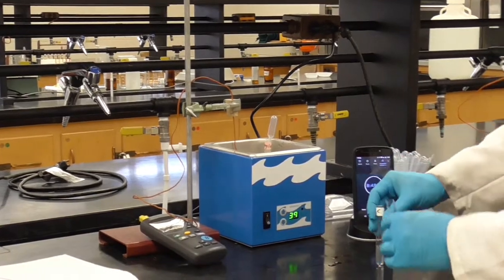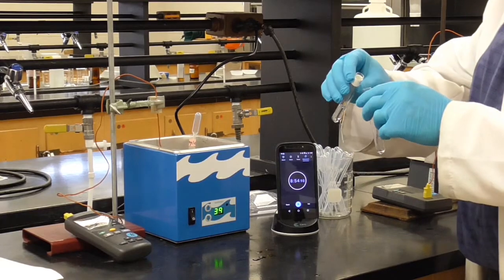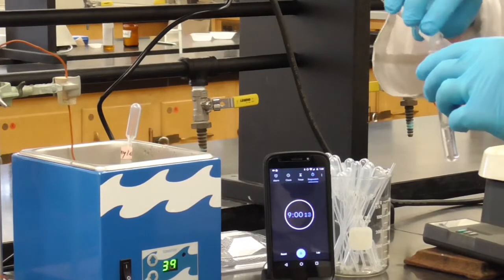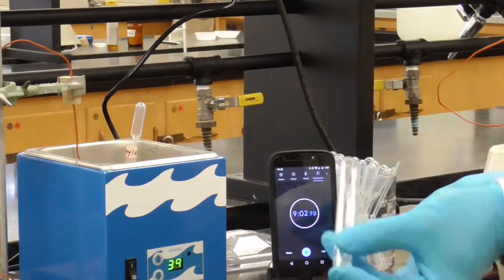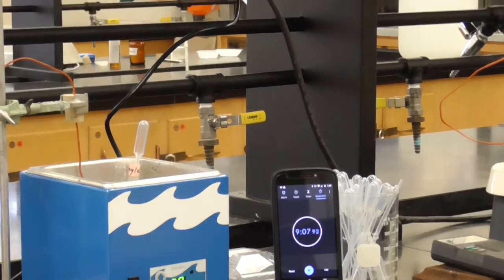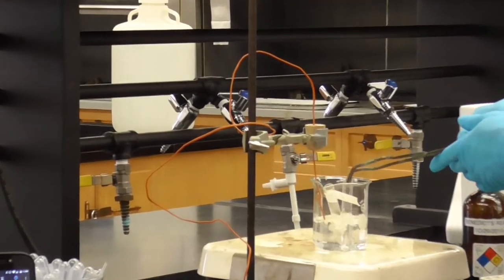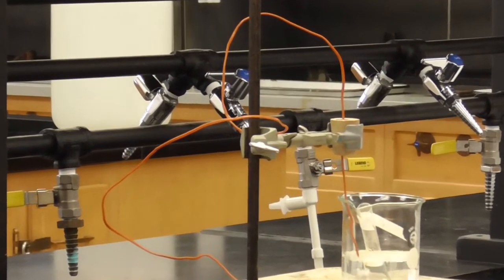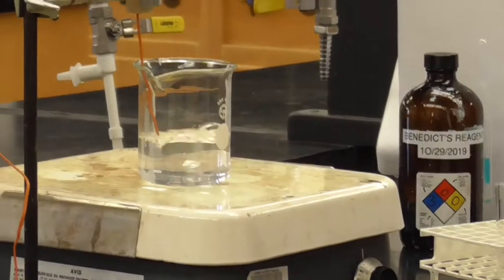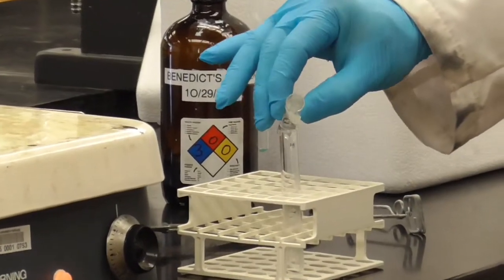And so at the 37 degree, here is our amylase enzyme, and again, here's the starch. We'll go ahead and pour that in to combine it together. Mix it. Put it back in. We'll do the same thing for the one that's 100 degrees. It's a little hot, so I'm going to take it out and put it in a test rack. Oops, like so. Okay, I can pick it up. Pour that in to combine it.